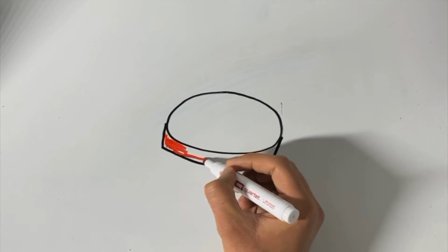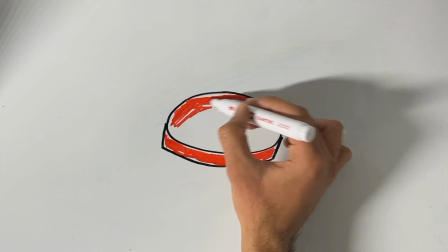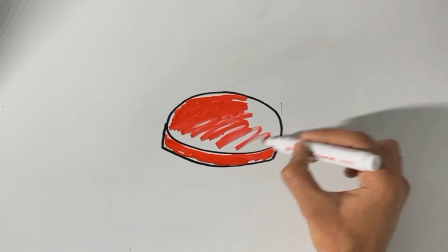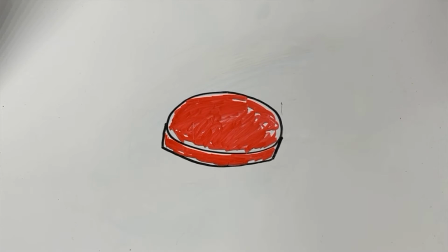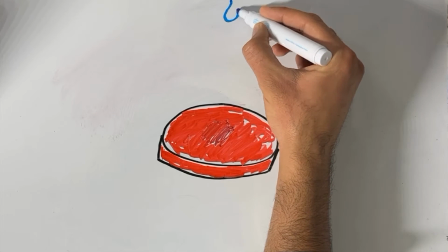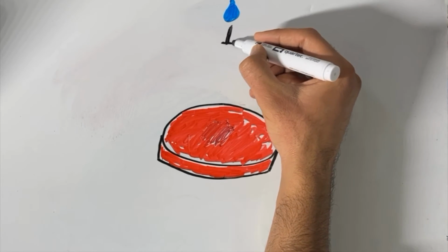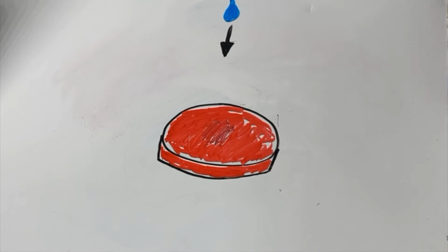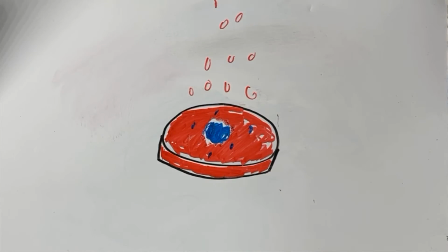We can find whether the reaction has stopped based on several different factors. We know that the reaction's product is a gas, and due to this, it bubbles out of the solution. Therefore, we can see that the reaction has stopped when the bubbles stop being evolved as a result of the reaction. Another indication that the reaction has stopped is when there is no more observed gas production from the solution. This can be tested with a stoppered Erlenmeyer flask connected to a syringe to measure the volume of the gas produced by the reaction.